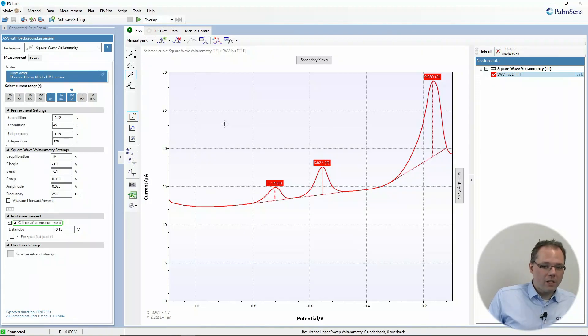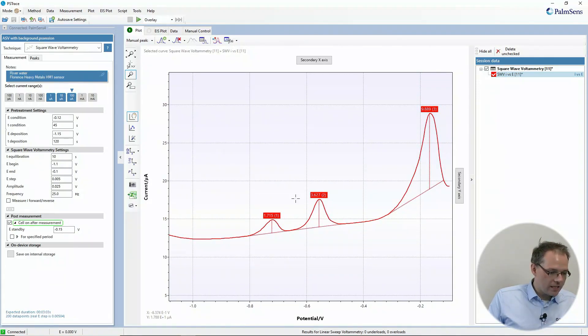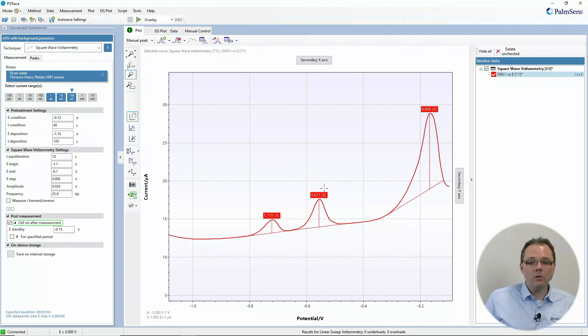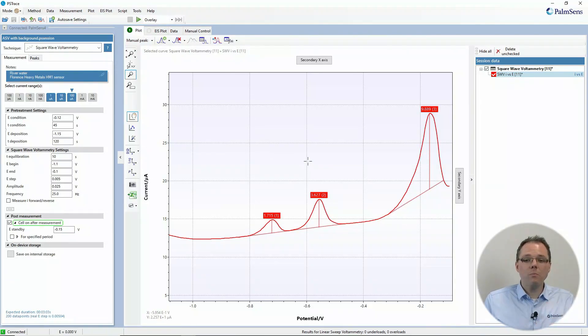I already loaded a curve here. It's actually a square wave voltammogram with multiple peaks. I use the Auto Peak Detection to find the peaks, and this is what most of you people will do.